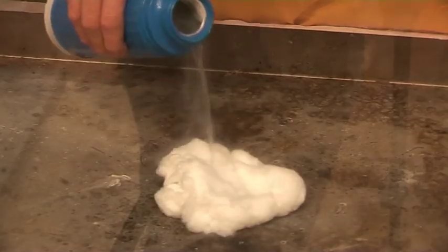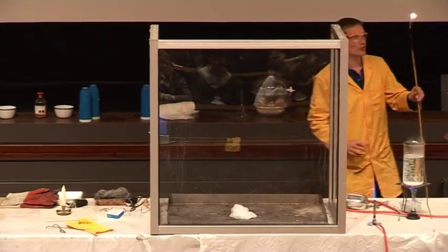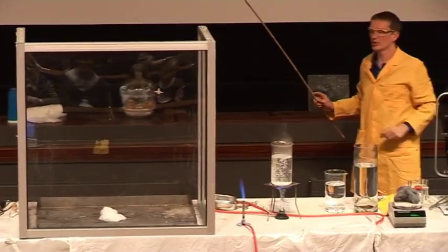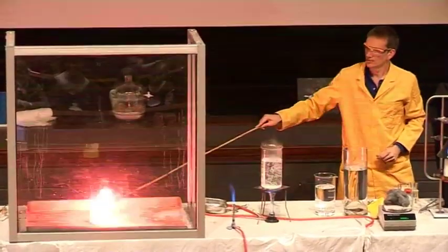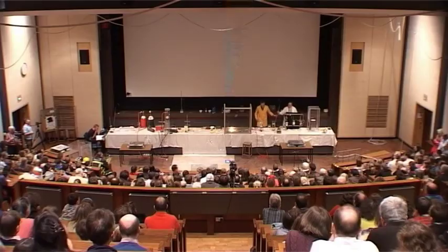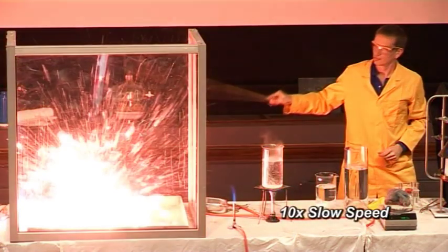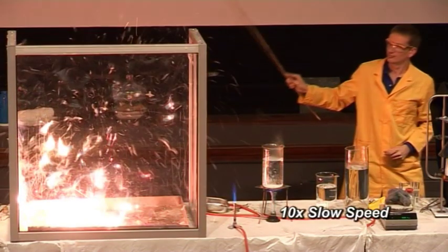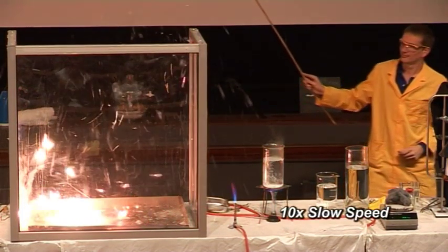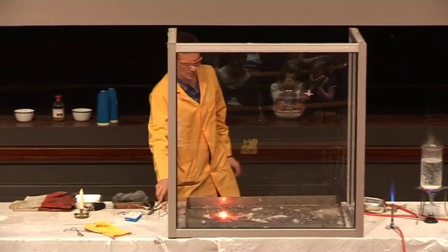I'm just pouring on some concentrated liquid oxygen, and we'll apply light to this and see if it burns slightly more quickly. Okay, so a little bit of oxygen helps enormously.